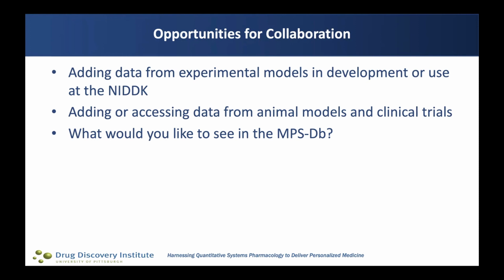One is many things are accessible without registering on the MPS database, but registration only takes about a minute. You just have to enter your email address. We keep that information all private so nobody else sees it, so you won't get spammed from registering on the MPS database. And we'd highly encourage you to do that. There is some information that's only accessible after you have registered.